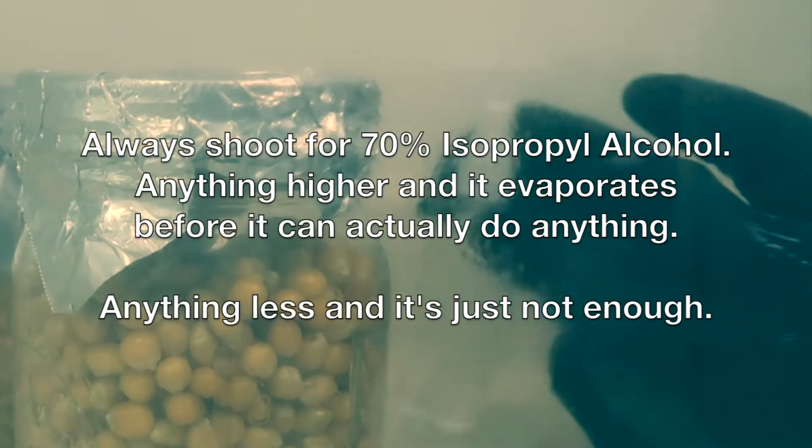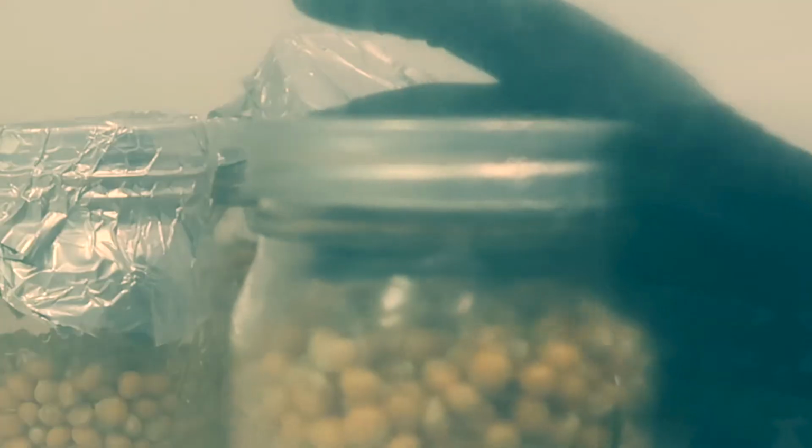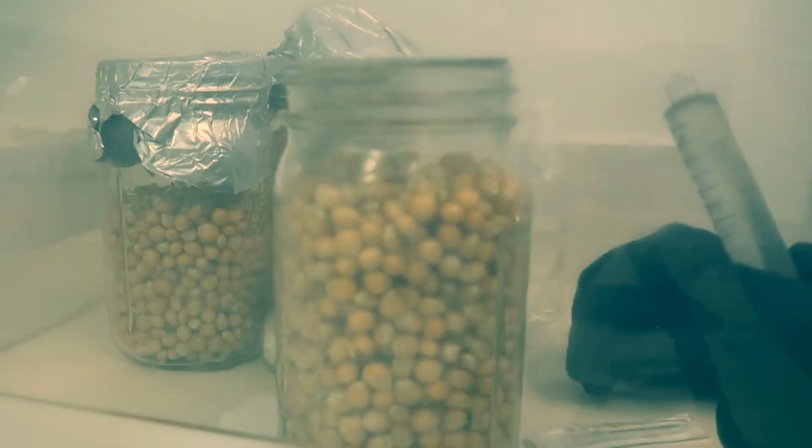Real quick, general isopropyl alcohol wipe down again. Remember, if you've got a spore syringe, to always shake it up very well. This one still has its sterile needle in the package, so I will not need to be flame sterilizing it, which is a good thing. Looking pretty well shaken up. Remove my dust cover here. Remove my lid band. I'll go ahead and get my needle attached here.